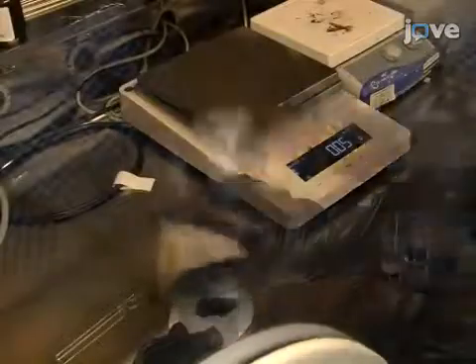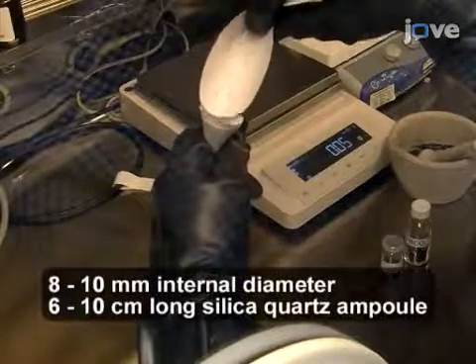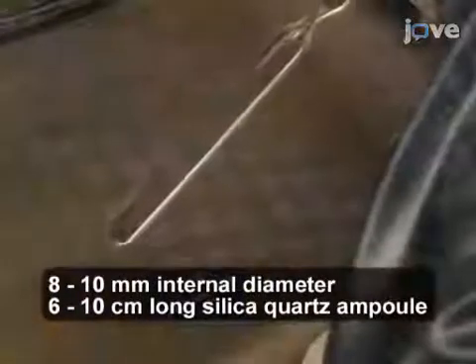While in the glove box, transfer the entire amount of the mixture to a silica quartz ampoule, sealed at one end and open at the other.